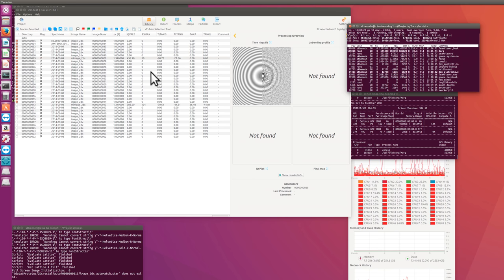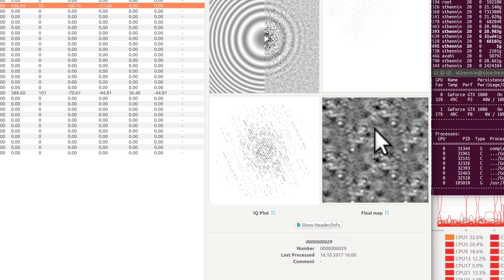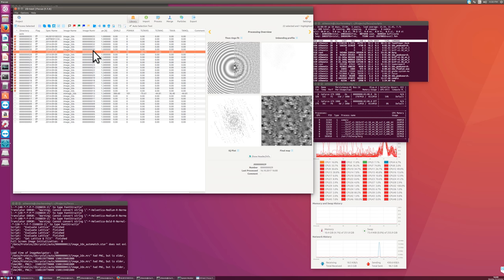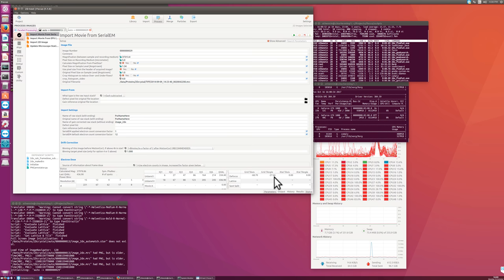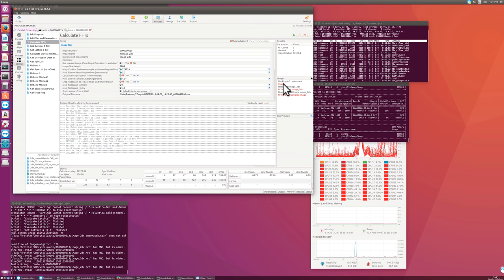There we are. So there's a Q value which is very high. And the image name was changed with an M in front, which is the masking. And the crystal here seems to be only in the top corner of this image. And there's our white protein, so this is again some tilt. Yeah, if I go to this image, the tilt axis here, and tilt angle is 30 degrees here. So if I click on the image, which one is this, before masking or after masking?